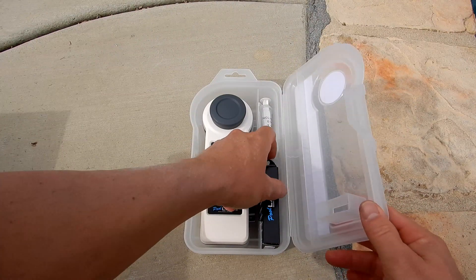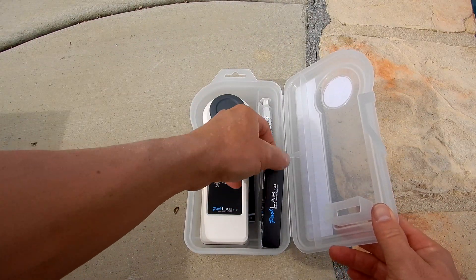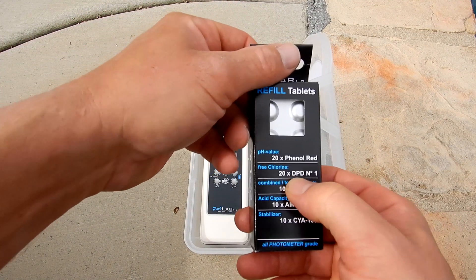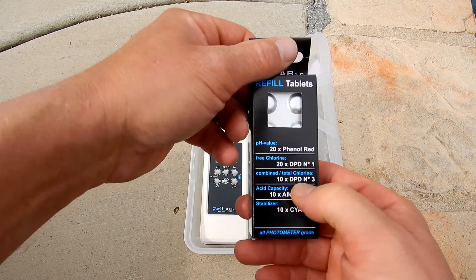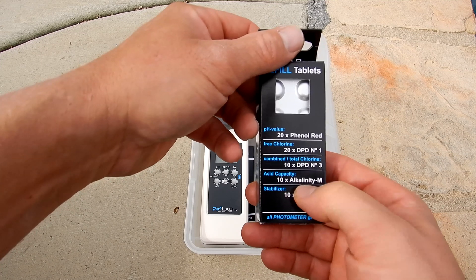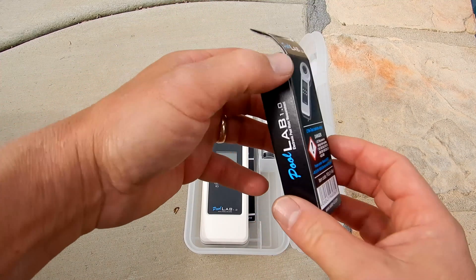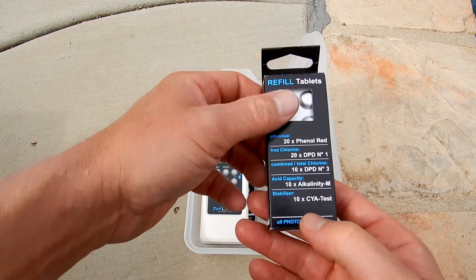Let me show you what comes with the PoolLab 1.0. You have some tablets here. It comes with 20 phenol red, 20 DPD 1, 10 DPD 3, 10 alkalinity, and 10 cyanuric acid testers. You can also order more tablets and tablets for the other tests.